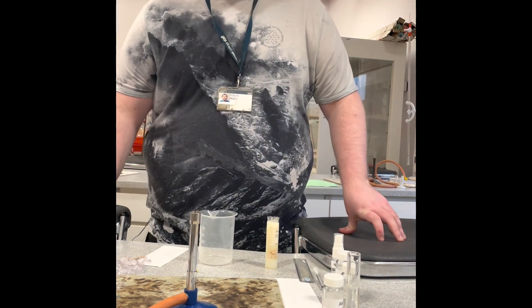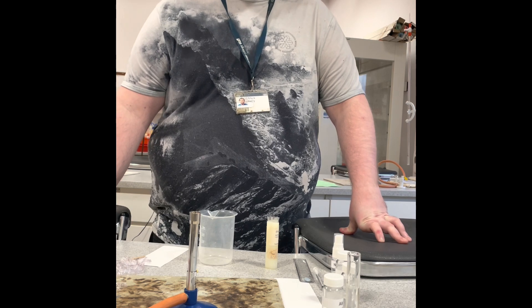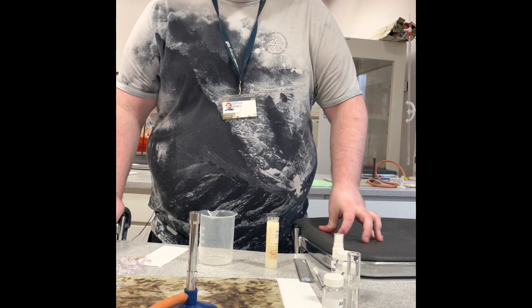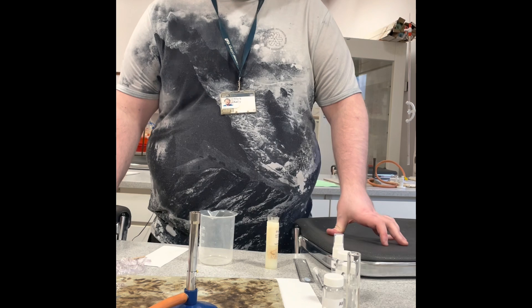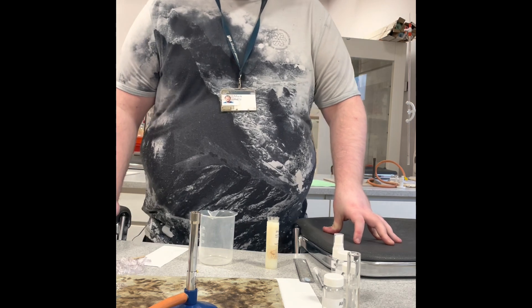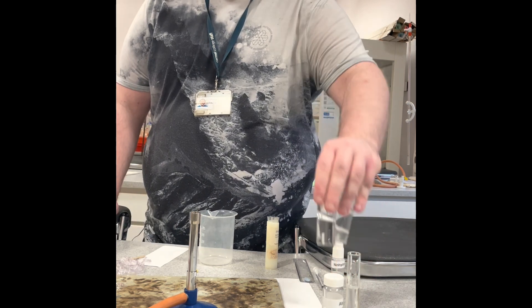Today we're going through amino acid chromatography, which is a required practical on the BTEC course. We're going to look at some different solvents, try to extract the chemical inside each solvent, and then do chromatography to separate them out. The difference between this one and plant chromatography is that the amino acids are all colourless liquids.